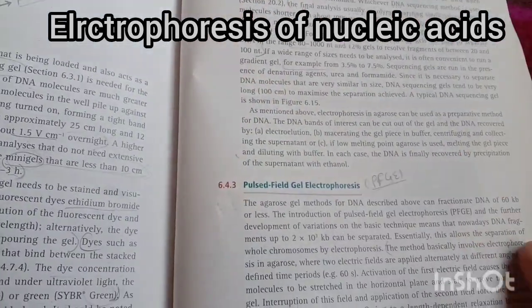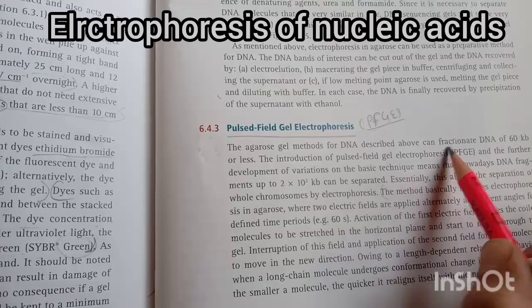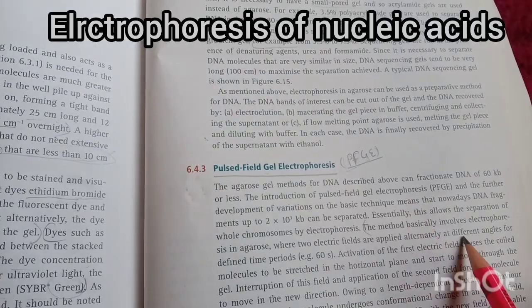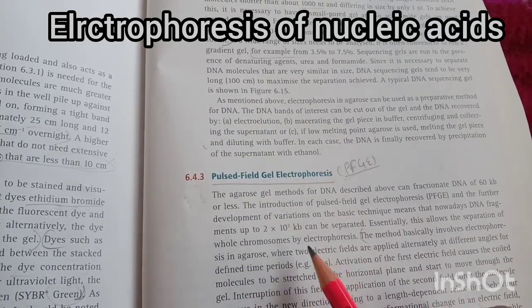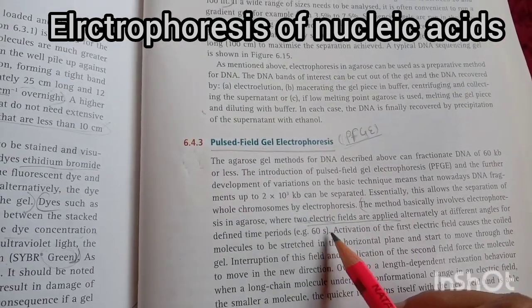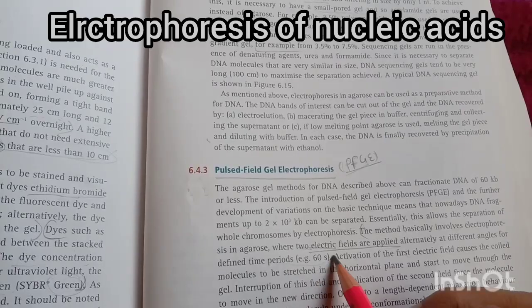Next we have pulse field electrophoresis. The agarose gel method for DNA described above, we already discussed. This method, pulse field gel electrophoresis, involves electrophoresis in agarose where two electric fields are applied. We use the two electric fields alternately at different angles for defined time periods, for example, 60 seconds.